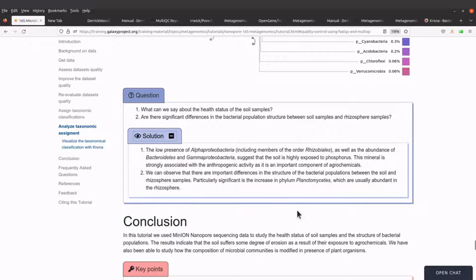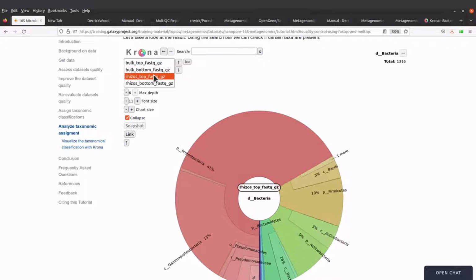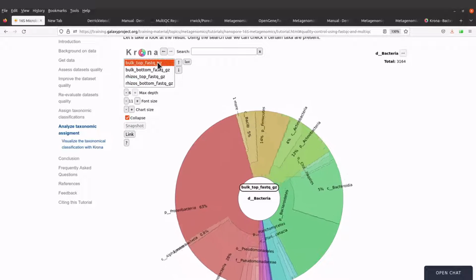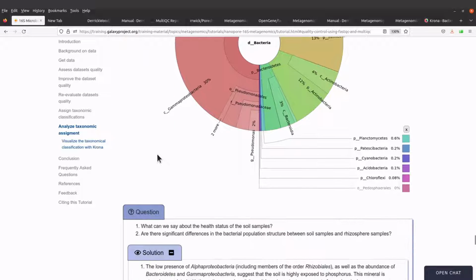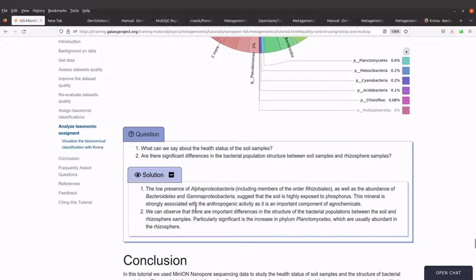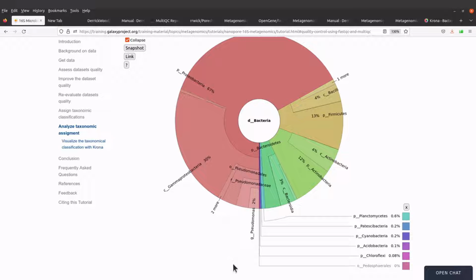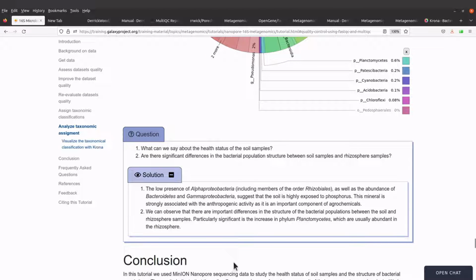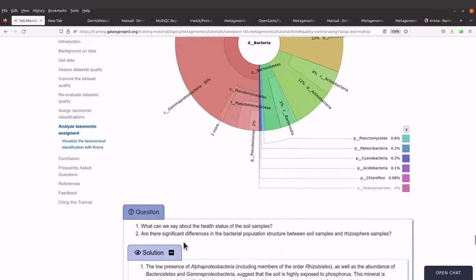So if you take a look at the individual plots for all the samples here, we are going to see those significant differences. We are just going to confirm what has been written here. The plots are here. All we are going to do is look at the result that we're given, because the answer here is based on this plot. But it's important we also study this plot so that we can agree on what has been given here.